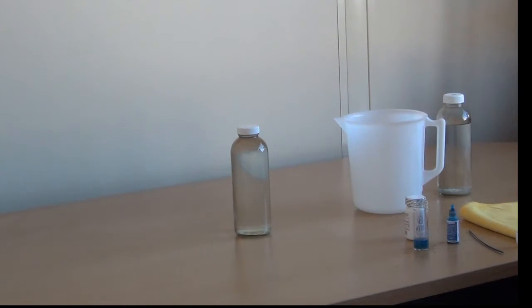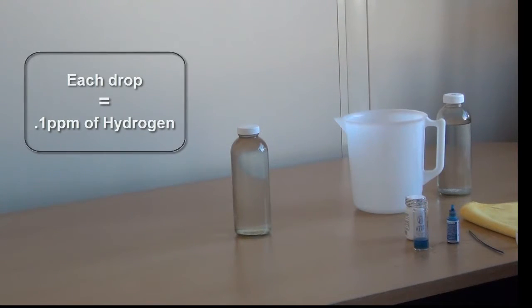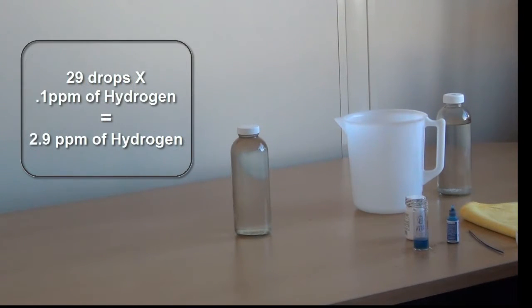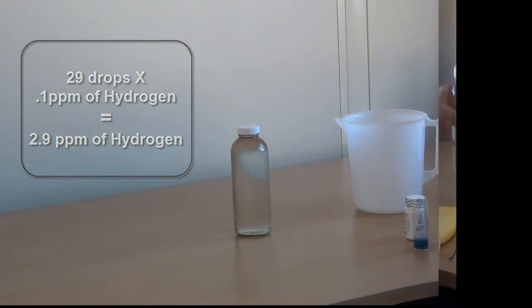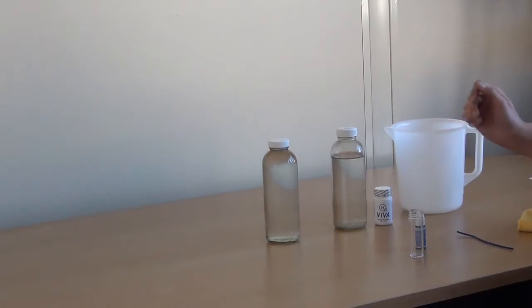So we had twenty-nine drops. Each drop represents point one part per million of hydrogen. Twenty-nine times point one equals two point nine parts per million of hydrogen in the water we tested.